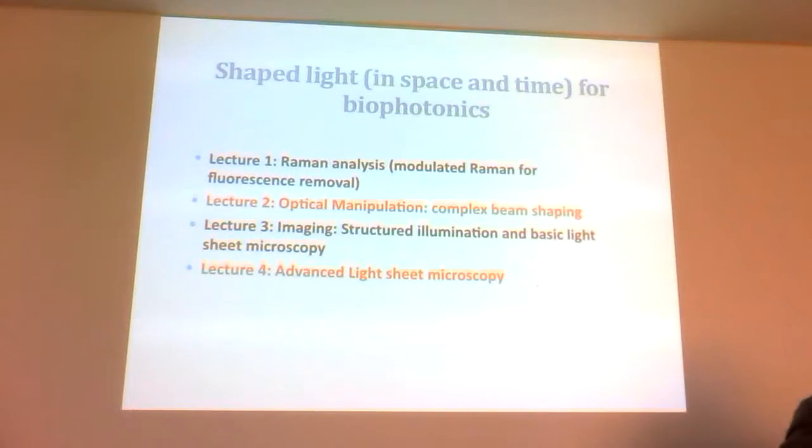in single molecule biophysics, and I'm going to use this as a test bed to show you complex beam shaping, which will then lead on to imaging, which, time permitting, we will do. I'll just show you. Okay, so here we go.